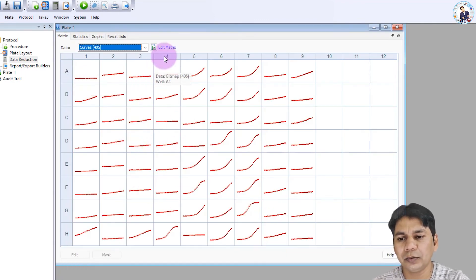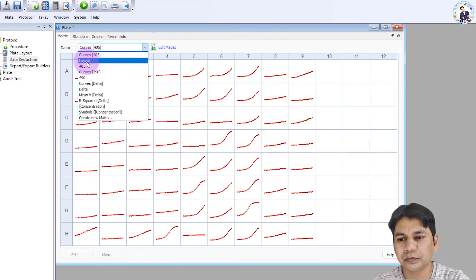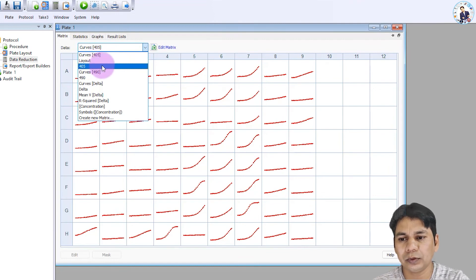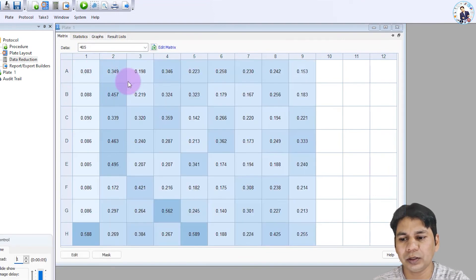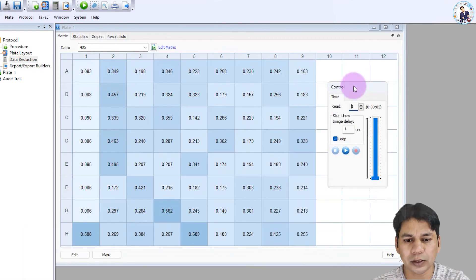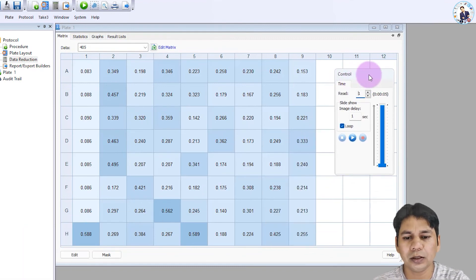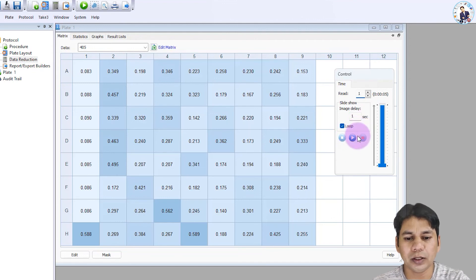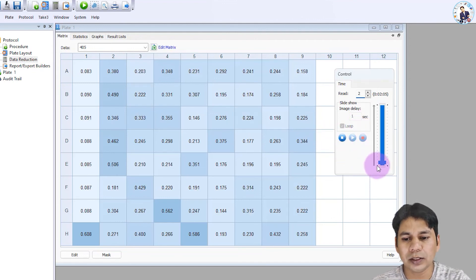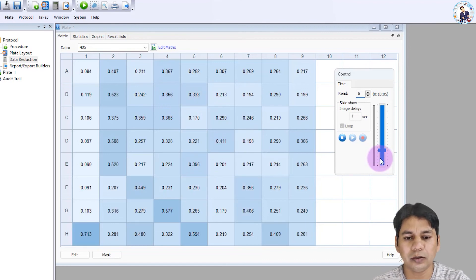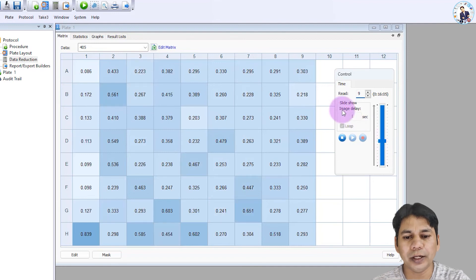If you change the display to 405 nm, it shows a control panel where you can see a video of the absorbance changing as the values progress according to the reads over time.